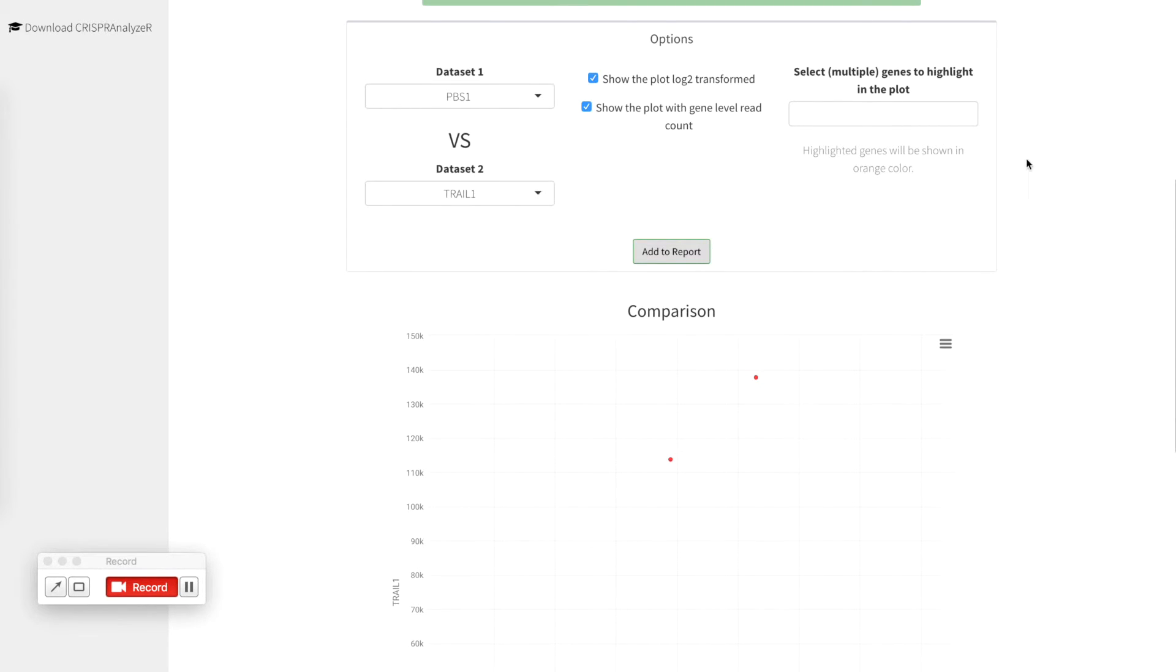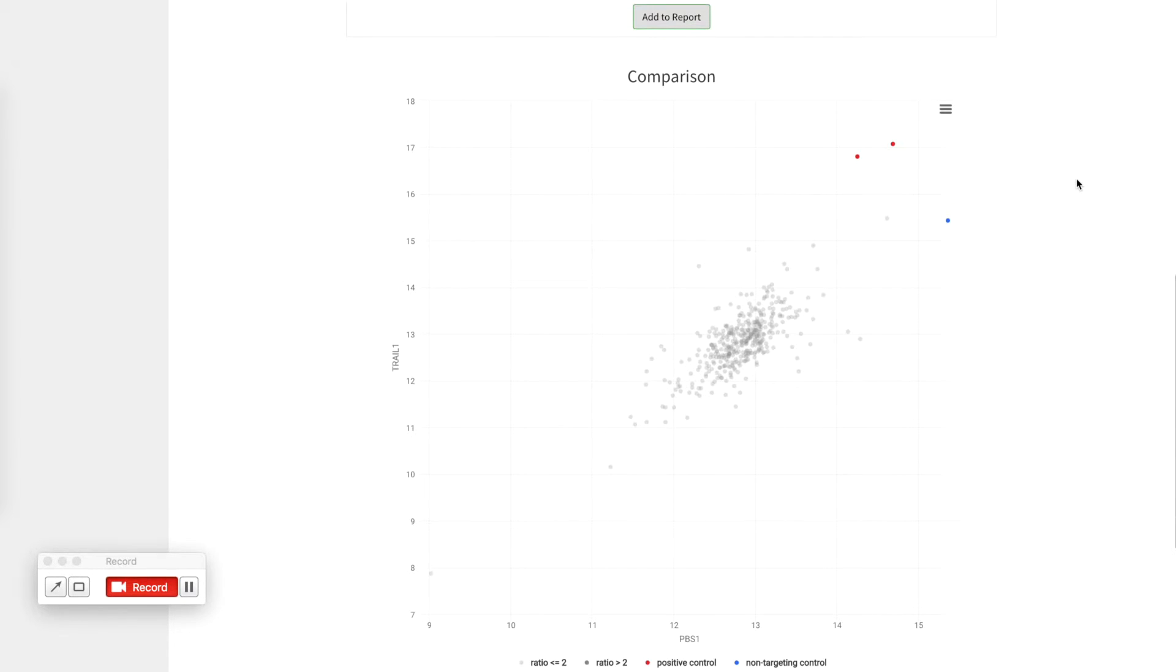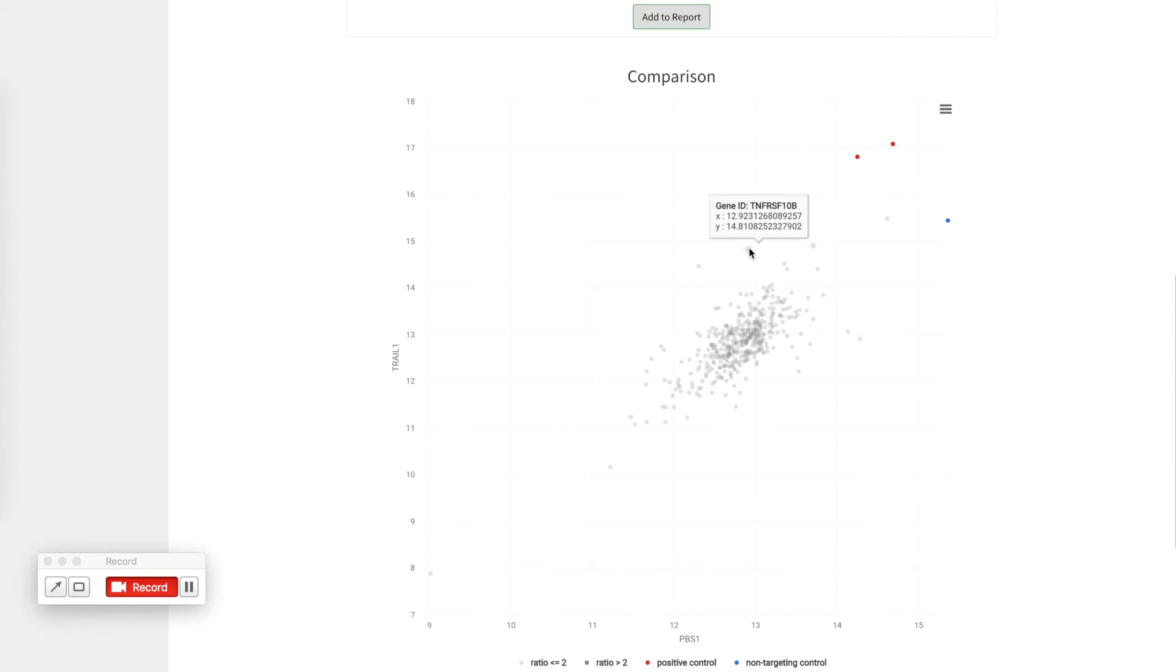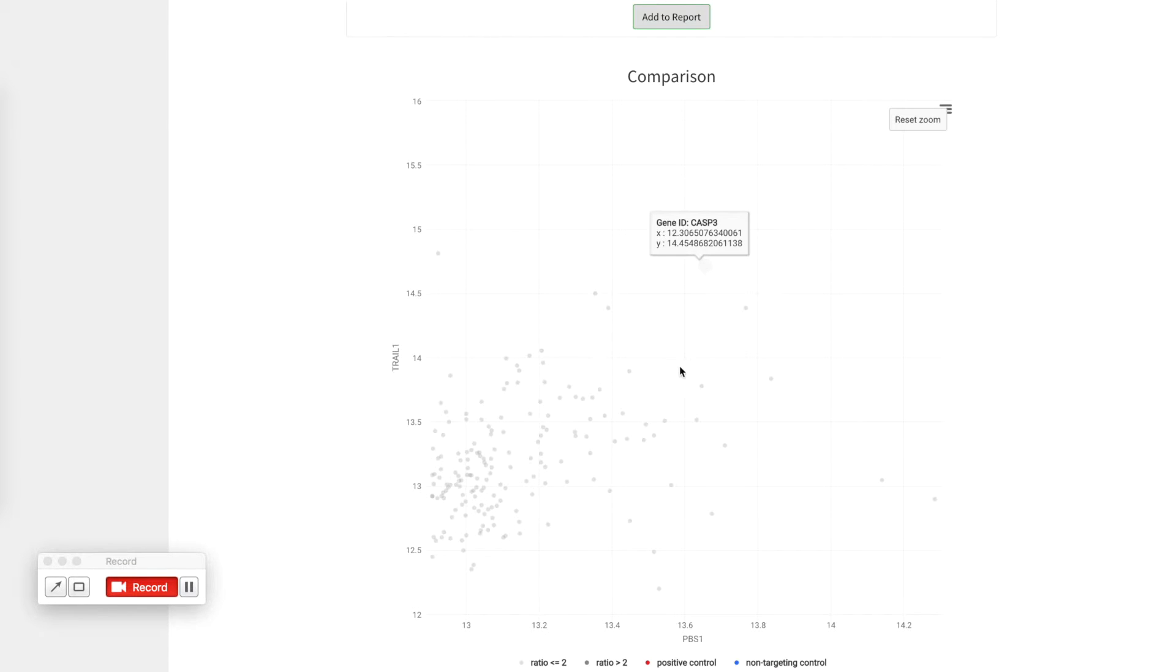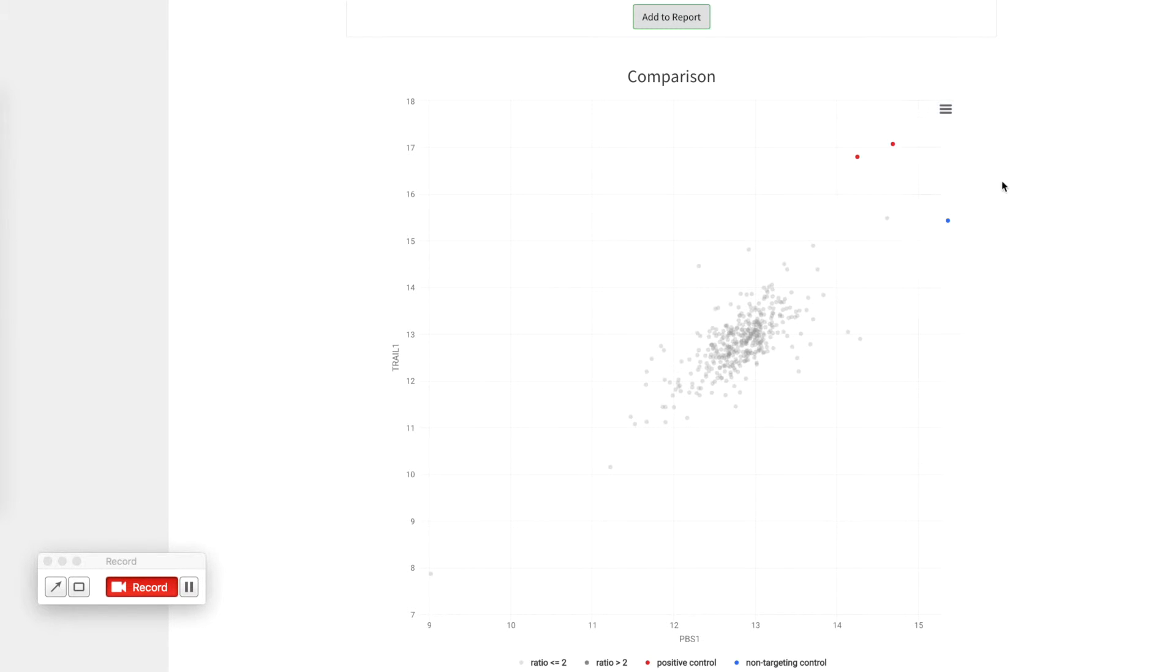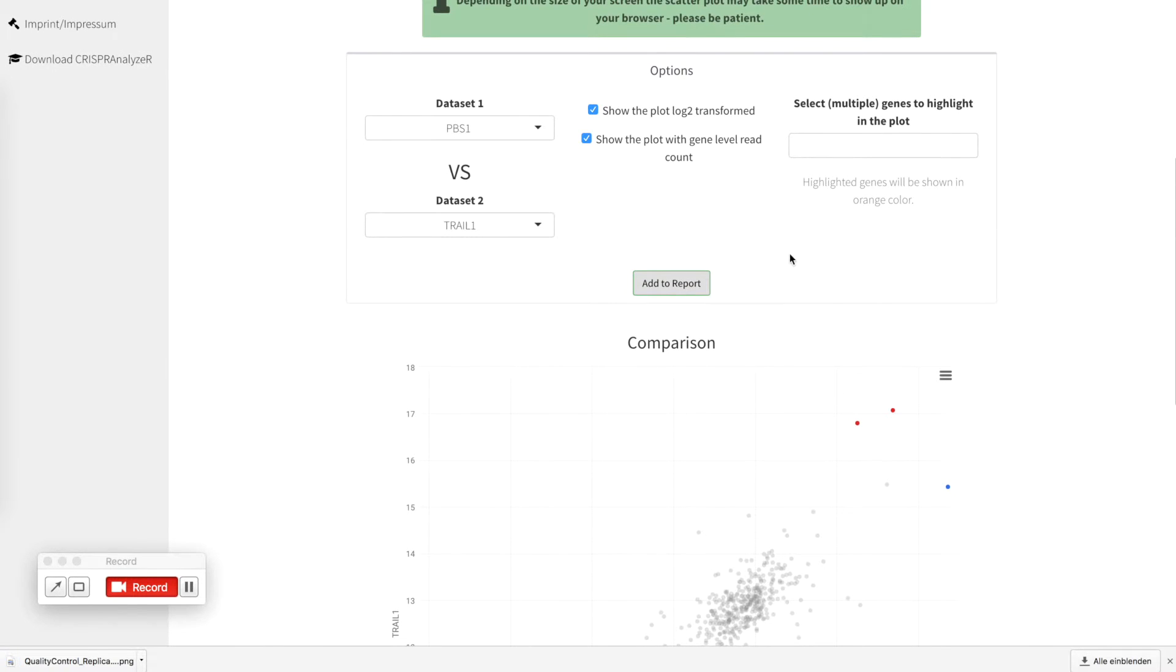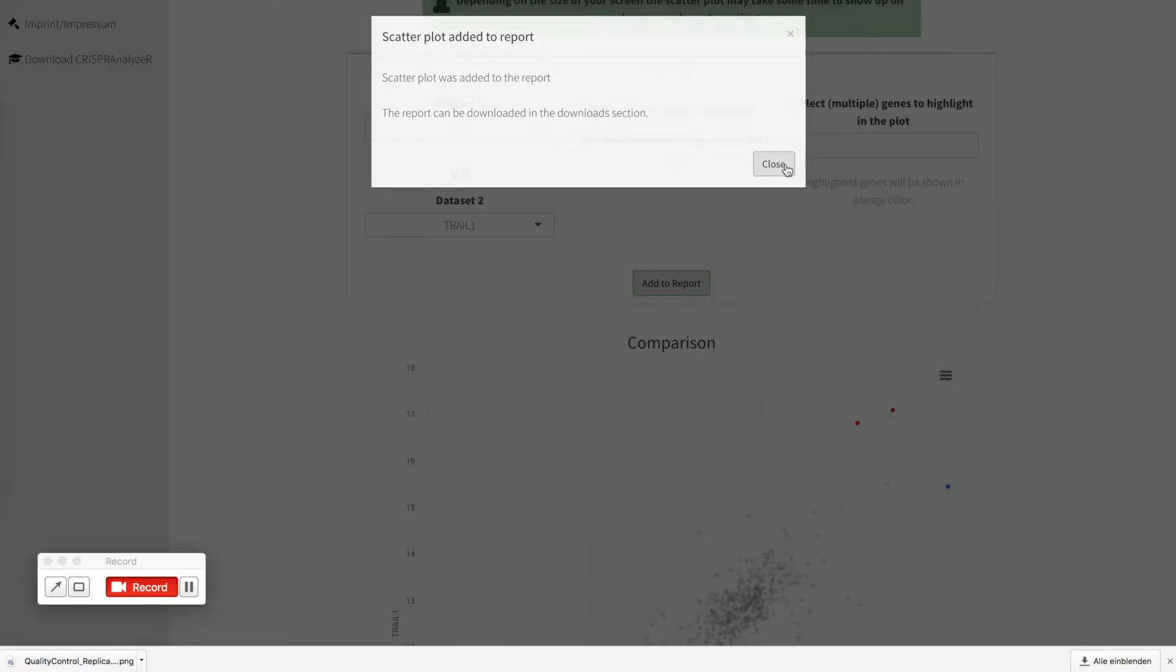You can also select and put the plot in a log2 transformation scale and if you like to know what certain dots are you can just click here and the hover will tell you the gene identifier. If you like you can also have a look closer by zooming in, going back or just downloading the plot as a png file if you like or add this plot to your report.